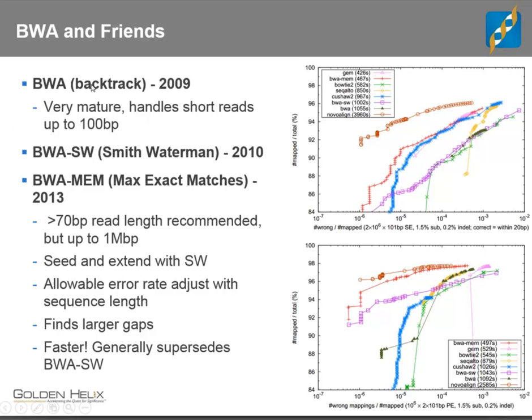But a couple things to keep in mind is he was thinking about this in terms of switching out that backtracking strategy for more of a place with those hashes and then use that local pairwise matching, which gives you a better alignment of a lot of places with complex numbers of insertions and deletions, handles larger insertions, where you might have like a 15 base pair gap or a 30 or 50 base pair gap, which could still be picked up by the read, but you're going to need something like a local alignment to be able to pick that out, as opposed to a backtracking algorithm, which just will never stick around long enough to guess that you have to go 50 base pairs out before you start matching the reference again.